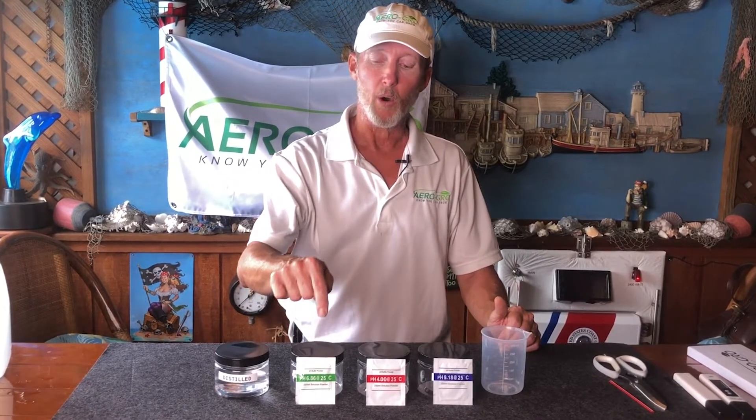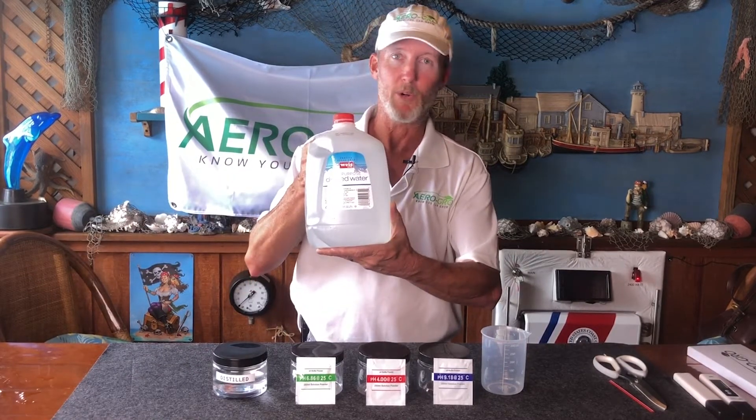What we're going to be doing today is called a three-point calibration. You can do either a one-point calibration, which focuses on the 6.86 as your only calibration metric, or you can do three-point. Three-point gives you better accuracy and it sets the entire meter back to factory spec. To get started, you always want a container of fresh distilled water — available at the grocery store — to rinse your meter between readings and when you're all done.